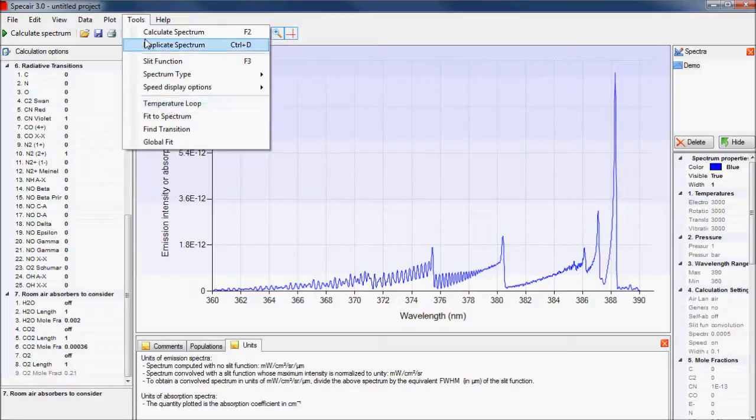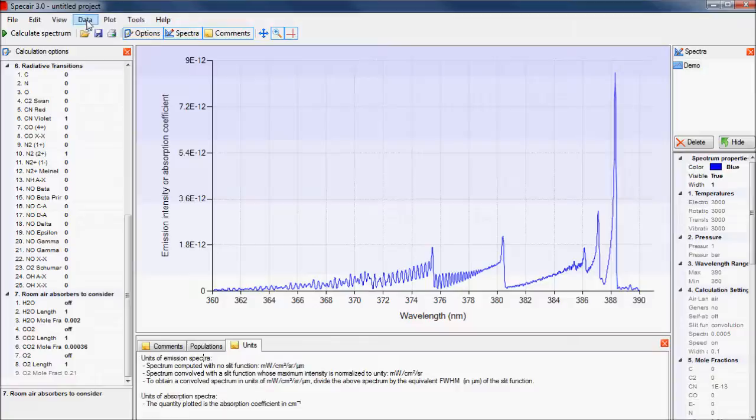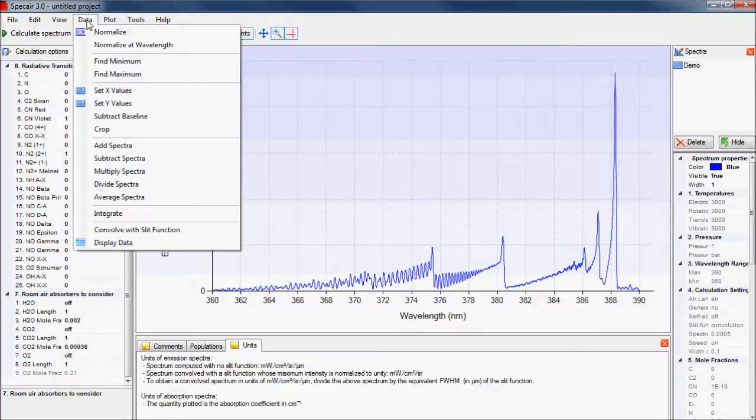SpecAir not only calculates spectra, but also provides many functions to facilitate the analysis and presentation of them. So SpecAir can be used as a standalone editor for experimental data.